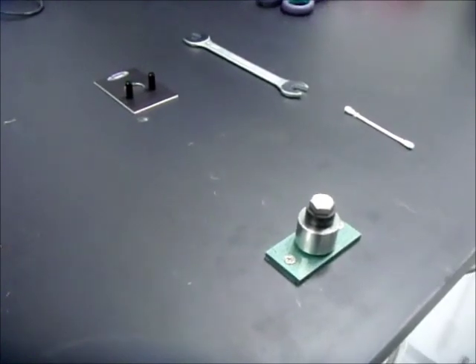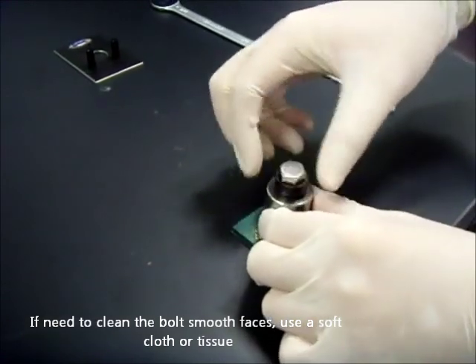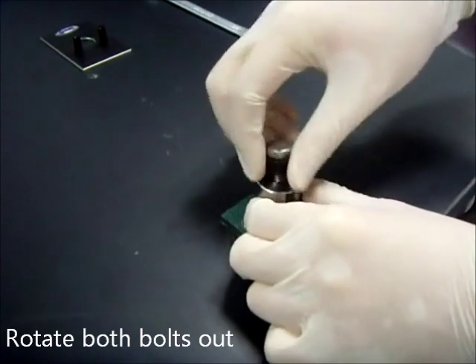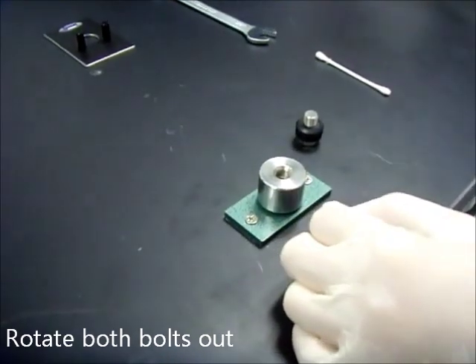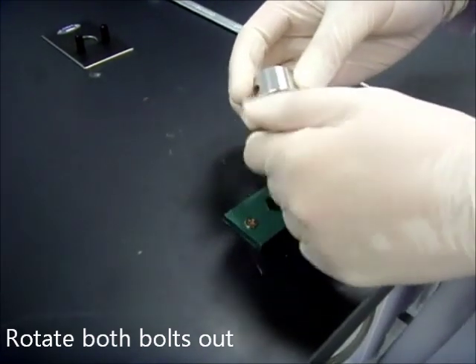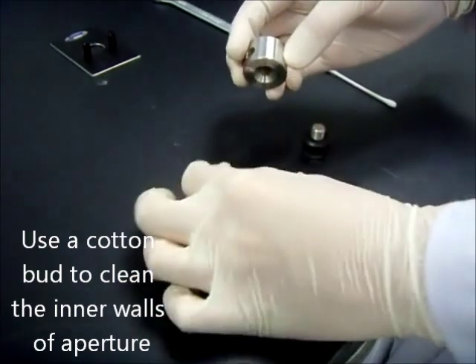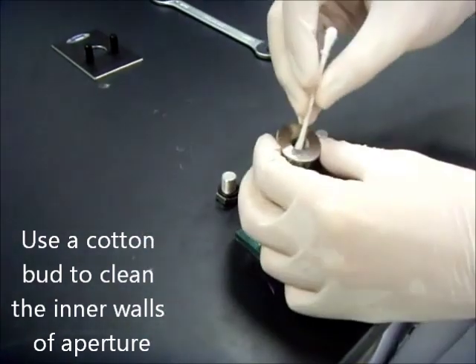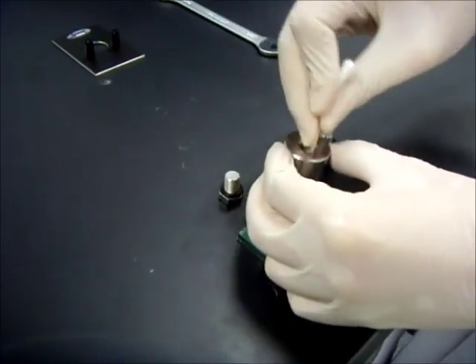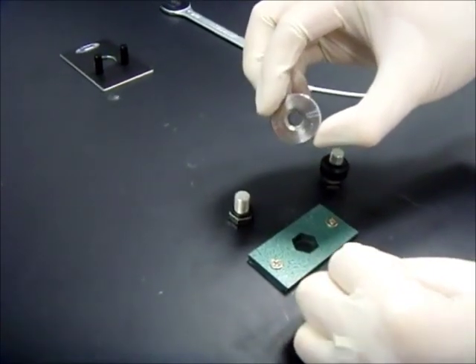Let us begin. When cleaning the bolt's polished faces, do not use a glove that has a hard abrasive texture. Always use a soft glove or tissue. Rotate both bolts out of the sample assembly. Use a cotton bud to clean the interior of the sample assembly. There should not be any trace remnants remaining. See the clear aperture?